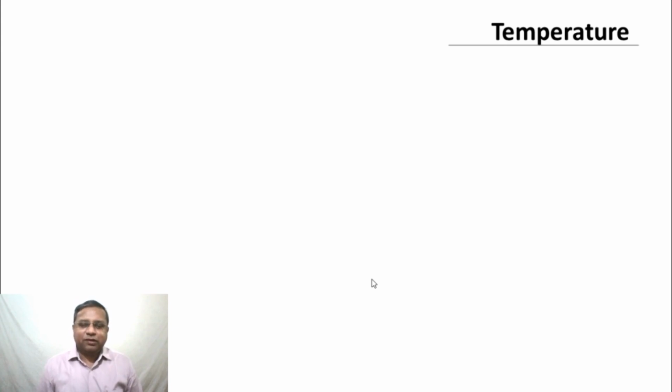For example, there are certain cells which function optimally at 30 degrees C. Our cells, mammalian cells, function optimally usually at 37 degrees C, and so on. But the range is rather narrow. It's about, let's say, 25 to about 37 degrees C is where most of the cells that we know of fall. There are, of course, variations, and that is what we are going to look at now in some sort of a complete picture.